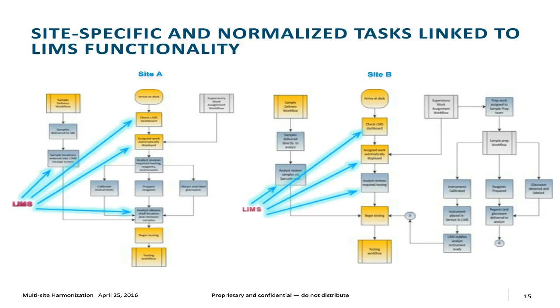Again, the second arrow refers to you're checking the LIMS dashboard. You're looking for the assigned work is the third arrow. The analyst reviews the required testing. All of those things on the right side are workflow that can be accomplished with the advent of LIMS.